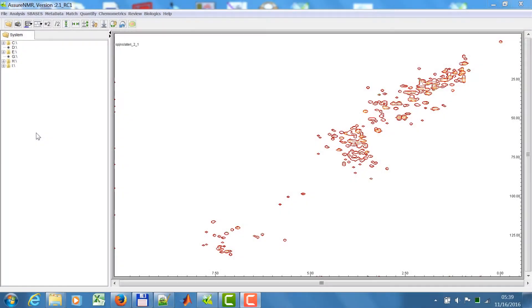This video shows how to identify compounds in HSQC spectra. On screen you will see the spectra of seminal fluid.